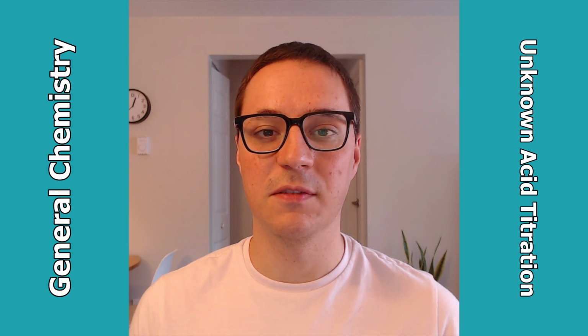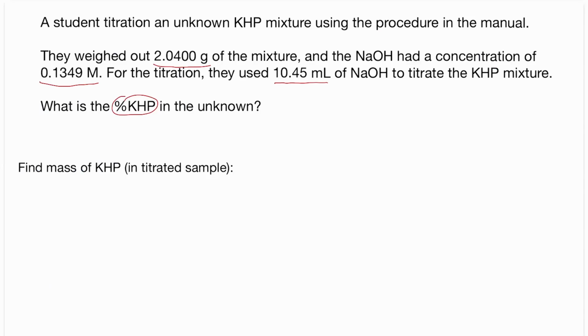KHP is. Since our unknown mixture was measured in units of mass, we need to compute our pure KHP in units of mass as well in order to make a comparison. So we'll start by just finding the mass of the pure KHP in the titrated sample. I'll start with the volume of NaOH used and convert that to moles using the concentration.